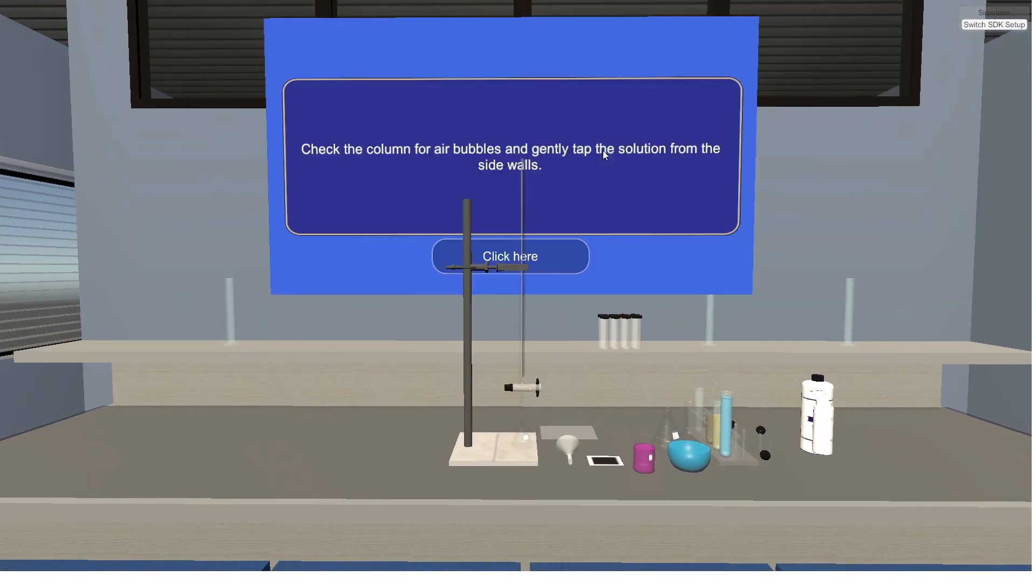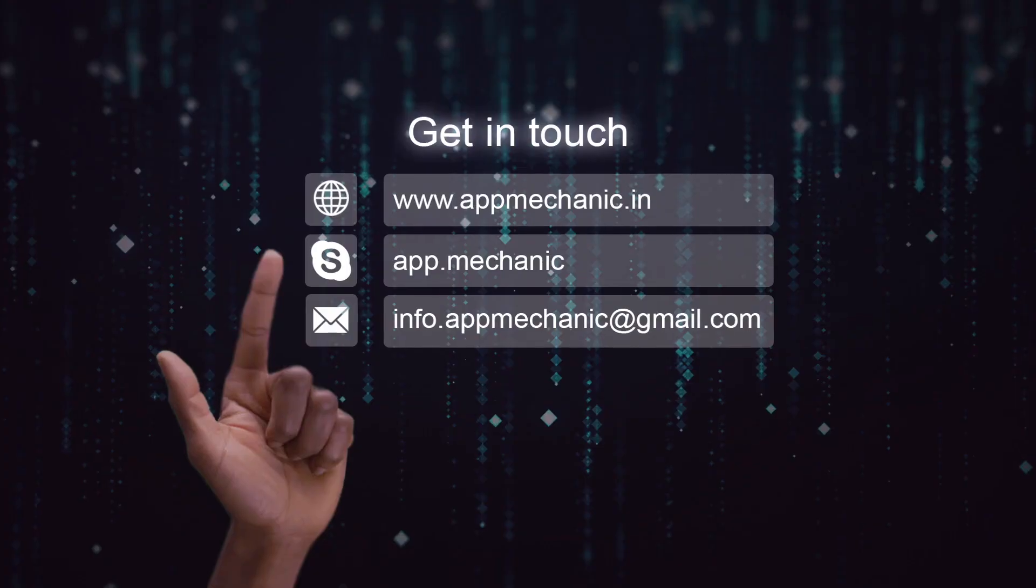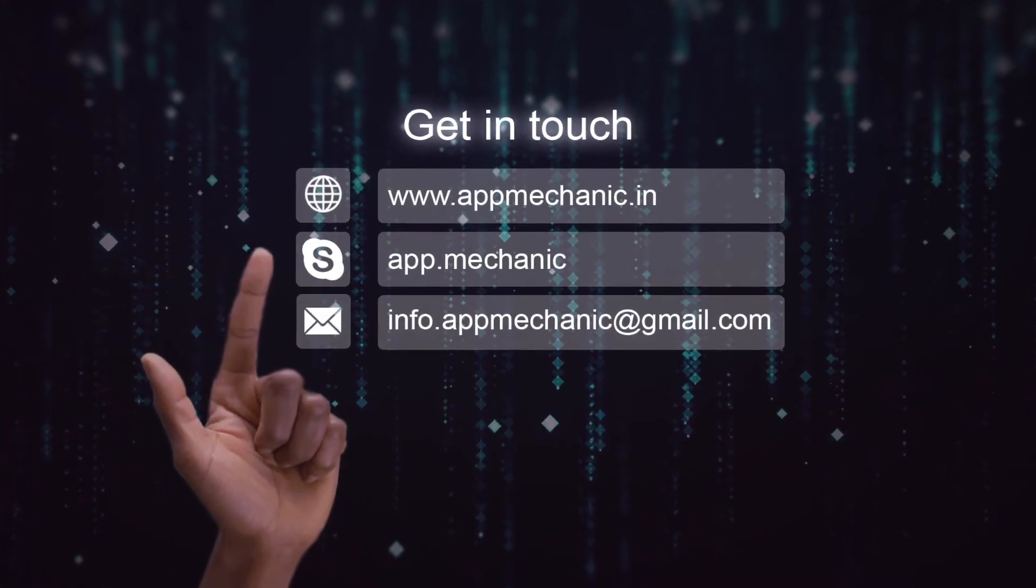Check the column for air bubbles and gently tap the solution from the side walls.